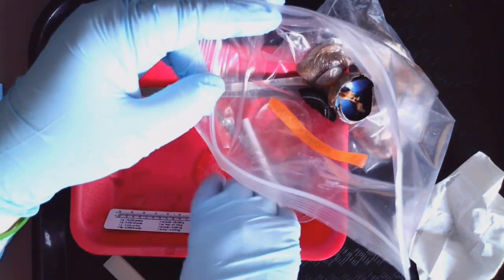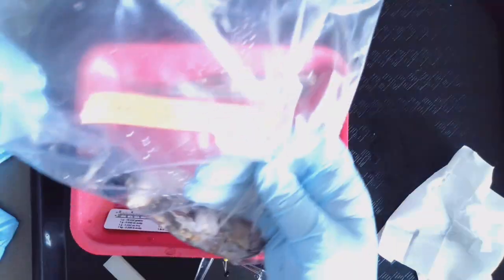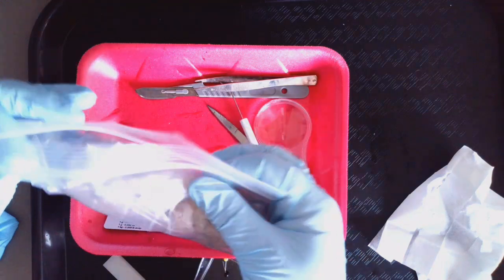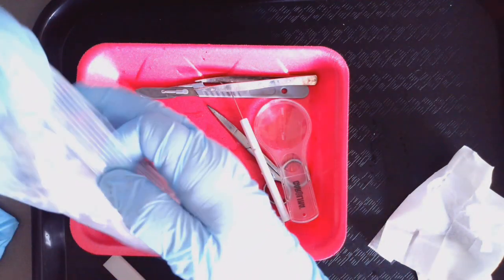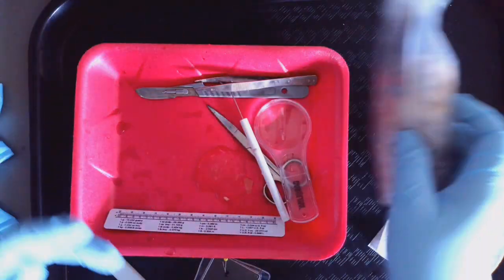Now, I don't need to worry about picking up this vitreous humor. I'm going to do that. That's the first step. And then I am going to kind of roll this bag, and then I'm going to seal it tightly. All right, so that is the first step.